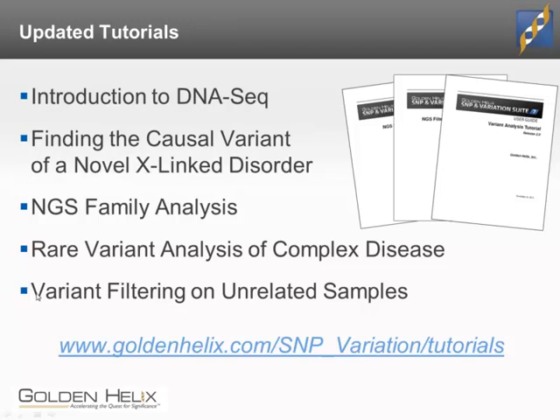Finally, we have a tutorial on variant filtering on unrelated samples. This includes filtering, variant classification, and tools to find variants unique to affected samples. To access these tutorials, please visit our website and click on Tutorials in the Resources menu.